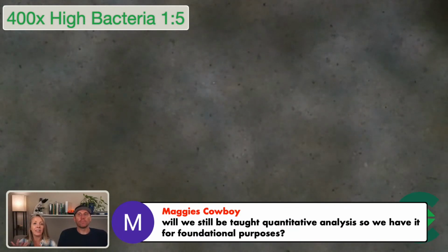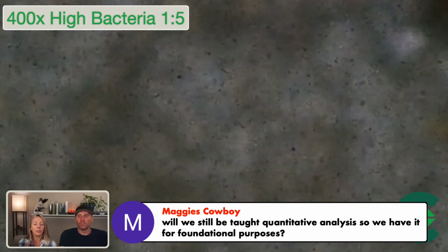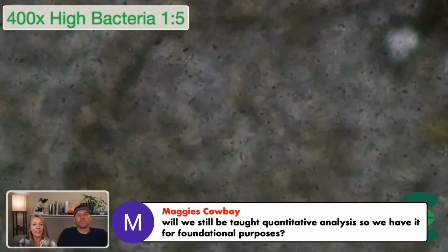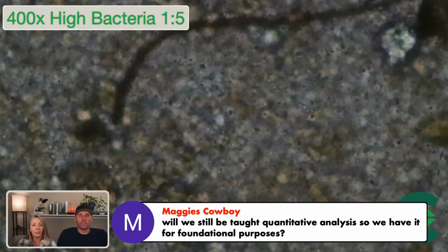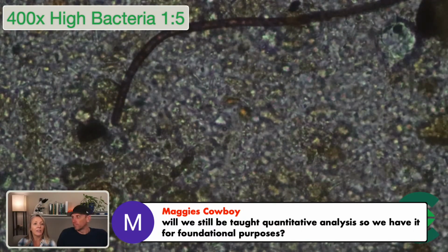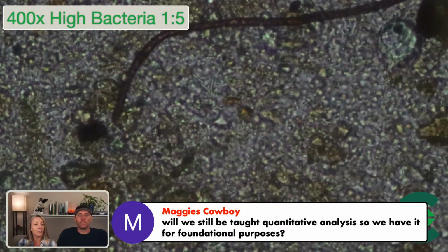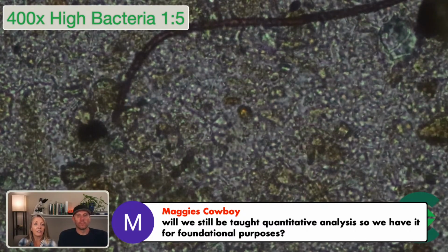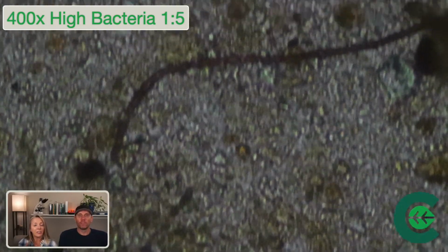analyzing your soil sample here. You can see I take a field of view, I scroll all the way up to the top of the sample, and then I slowly go down through the sample, taking note of the bacteria and what I'm seeing along the way. A lot of the flagellates will be floating around the top. Here now we're getting down to the bottom of the sample. You can see that we do have some fungi in here, that big long strand.